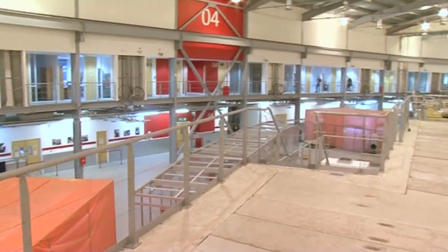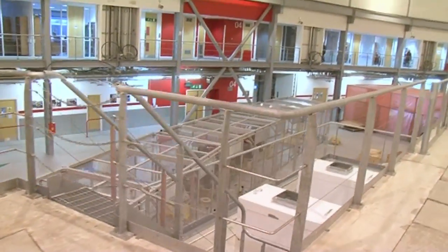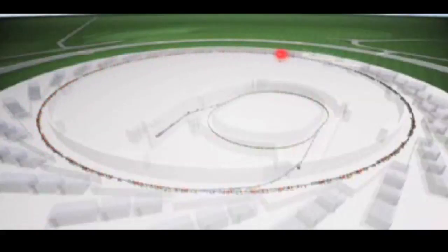At the moment we're walking on top of the storage ring. On the inside it's a small tube under very high vacuum, surrounded by magnets that focus and steer the electron beam going round the ring. Each time the electron beam bends, we get a bright beam of light coming off at a tangent to the ring, and as the beam comes off, that's where we build the beamline.